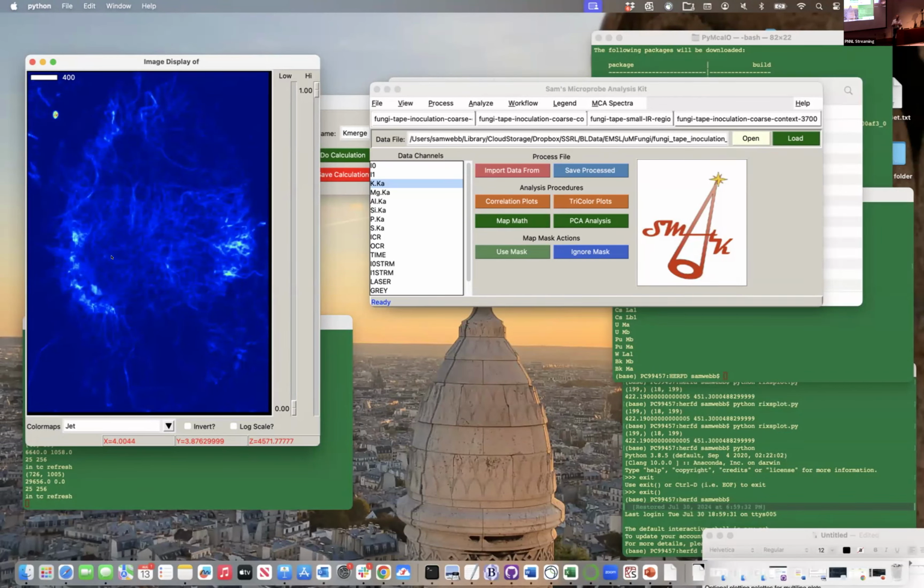Desktop options are very popular too. It's not on the forum yet, but that's a good place to put it though. Haha. Yeah, so documentation is coming forthwith.